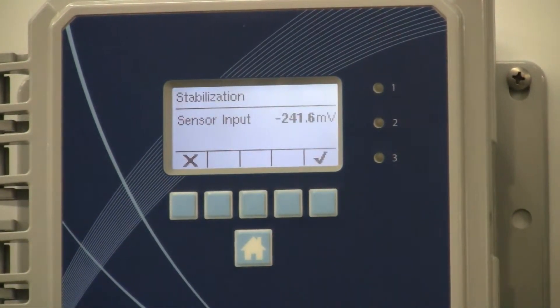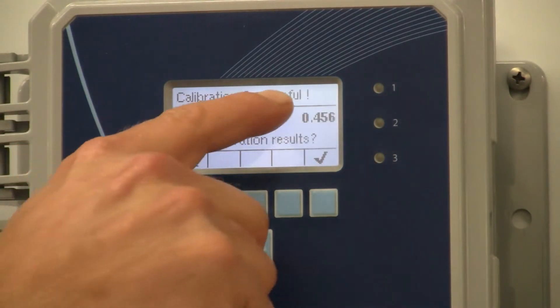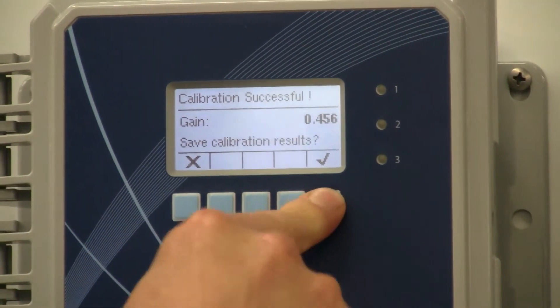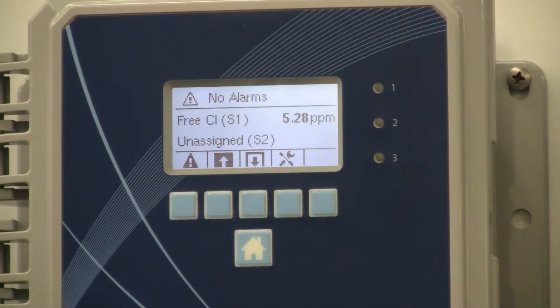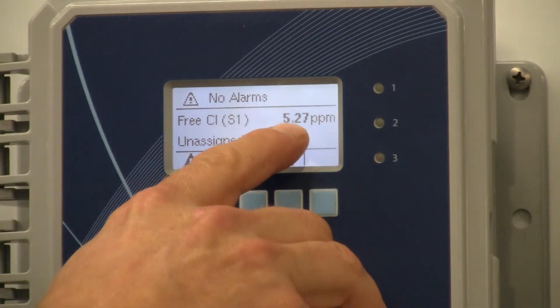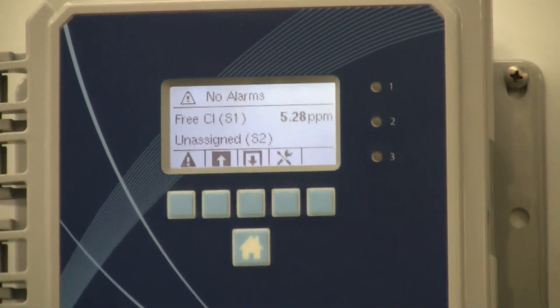The calibration is running now. Calibration is successful — there is the new gain number. You hit the check mark to save the result. And that is all there is to it — the chlorine sensor is now measuring 5.27 versus 5.3. That's it, thanks.